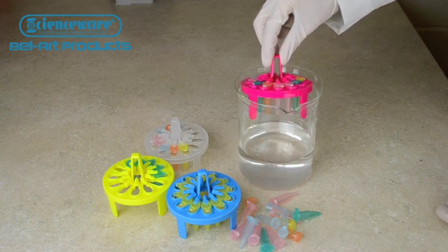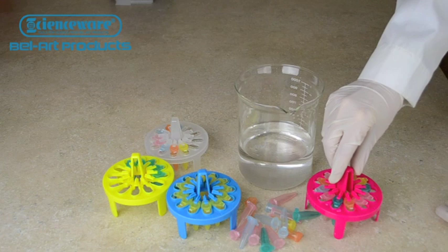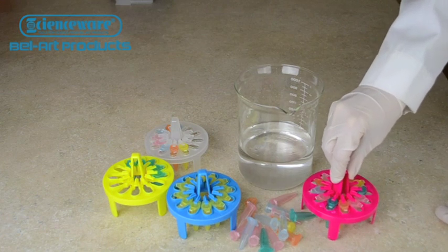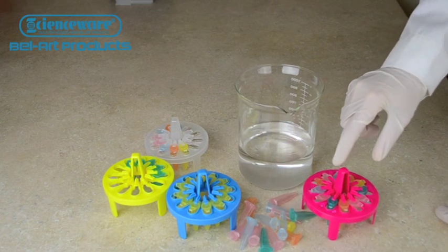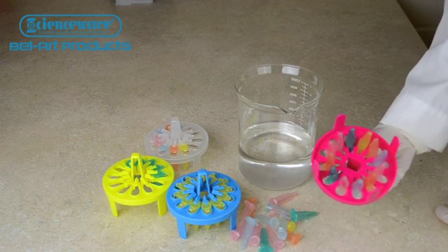A raised handle allows for easy lifting without agitating the samples, and stable feet keep racks upright on the bench no matter how many tubes are in the rack. But even if the rack did get knocked over or turned upside down, your samples would be safe.